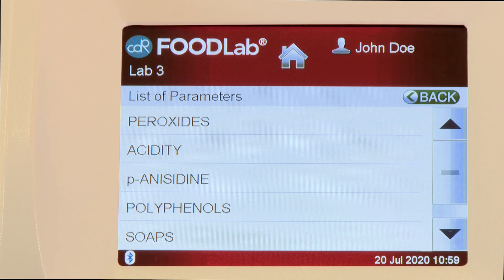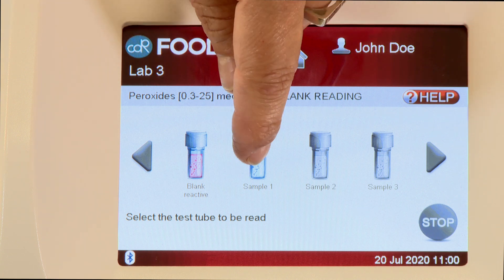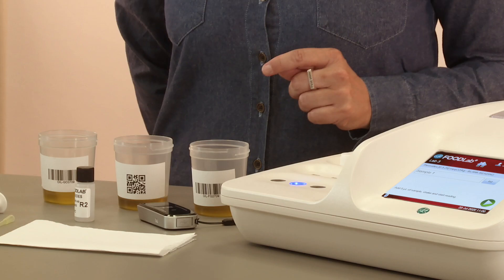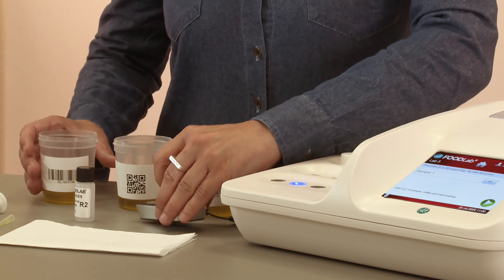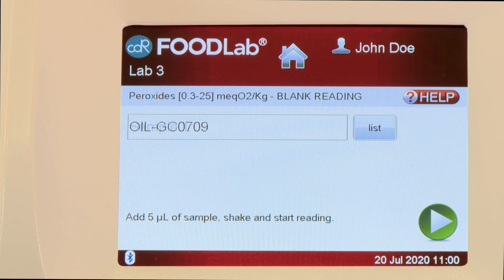First, select the desired test from the menu. Select on the screen the first sample to be read. After that, read the first sample barcode by using the PX20 Reader. The first sample code will appear on the screen.